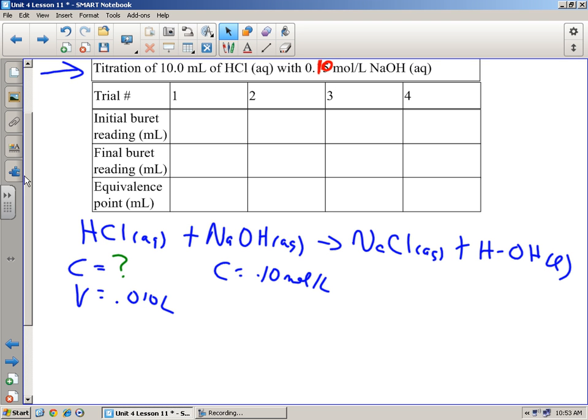It's not only going to go over the burette, you're going to have sodium hydroxide, which of course is very dangerous to you. And it's going to go on the table. We're going to have to wipe it up, etc., etc. Okay? So be very careful, and don't do that. Obviously the stuff we're using is not very high strength, but nonetheless, it leaks over the side here, and if you don't get every last drop cleaned up, it will eventually get onto the tip and get into your solution, and it's going to affect your results.